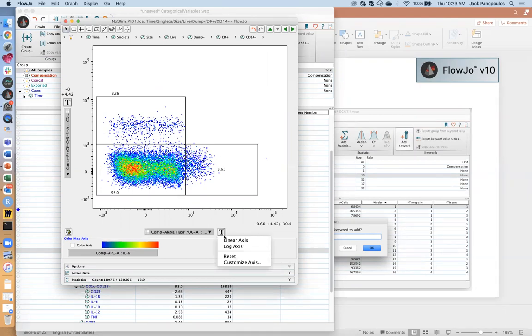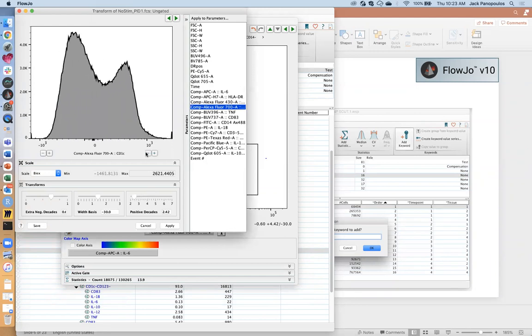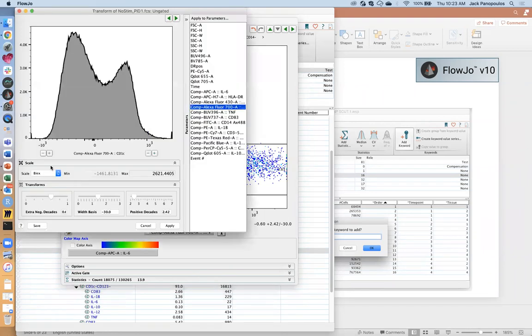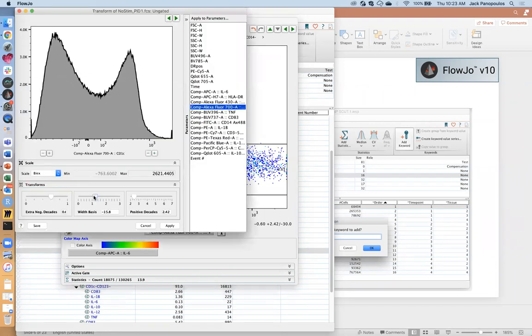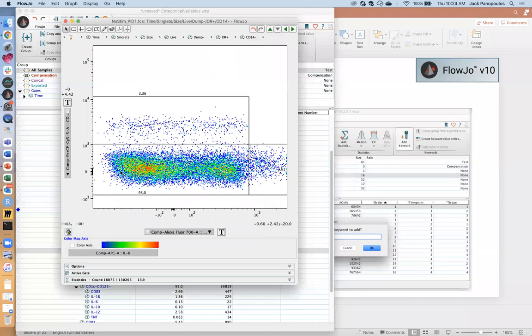So I'm going to do a little transformation here. I'm going to customize the axis and try to get rid of that white space so that we really emphasize this stretching of the data. I don't want things to pile up on this axis. Same thing on the left-hand side: maybe I can stretch this out a little towards the left so we have some events not pressed up too much over here, but almost touching. How's that? Something like this, so that we get better separation between these. The bigger the distance, the better the result.